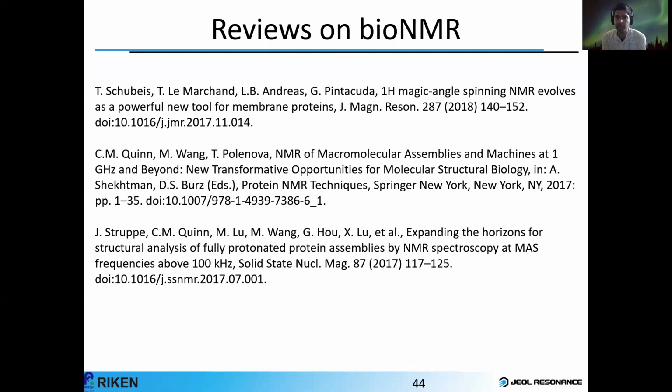Yeah, thank you, Vipin. I think your question also answers one of the other questions that another anonymous attendee had about using helium to spin faster at low temperature. So maybe just moving on, a question from Dahiana. What would be an optimal experiment to measure fluorine, which has huge homonuclear dipole-dipole interaction?